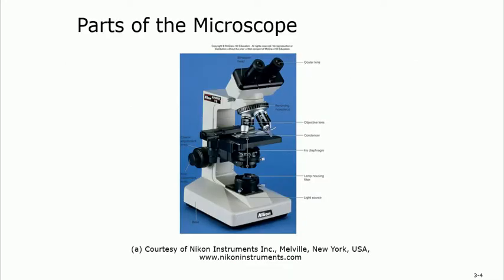These are the different parts of the microscope that we need to know. This here is called the ocular lens — it's one of the two lenses we need to know. This is called the nosepiece; it looks like a nose, so you can rotate it around to use one of the objective lenses. We can have three or four objective lenses, and on every one of them it mentions the magnification power — this one is 100, this is 40, and so on. Each objective lens has a magnifying power.